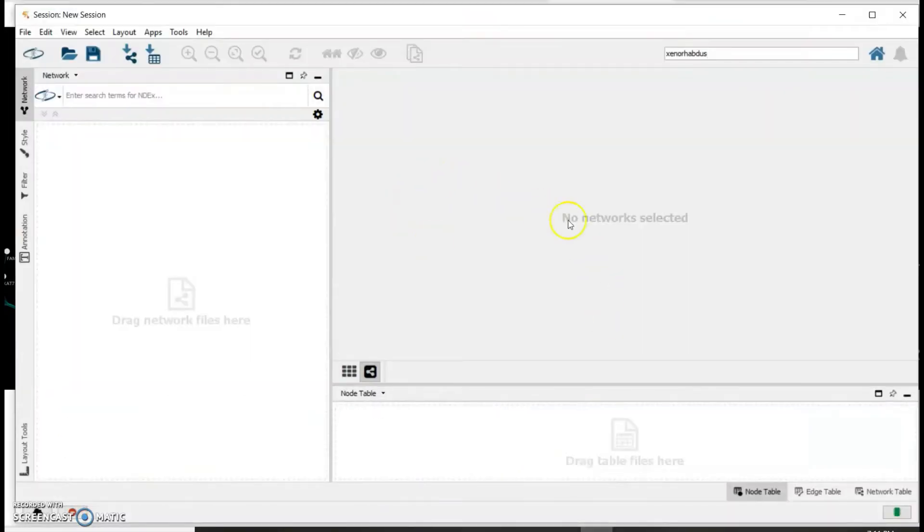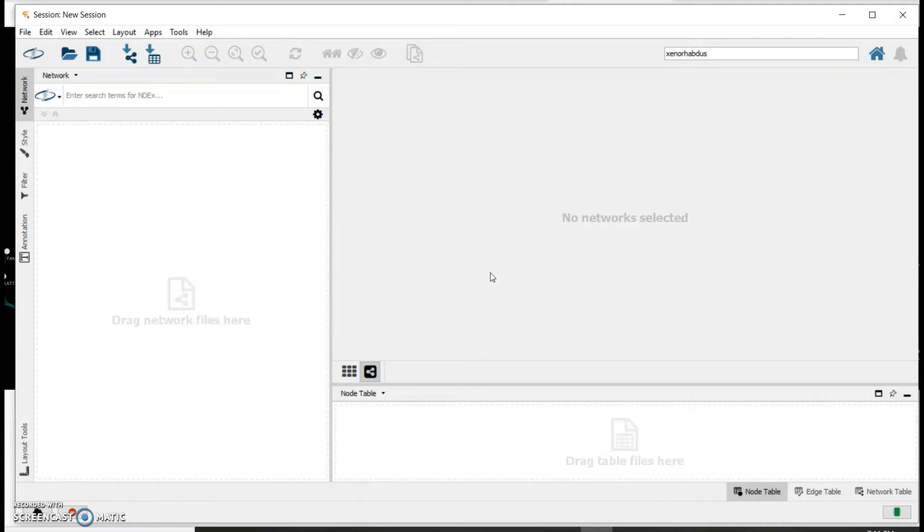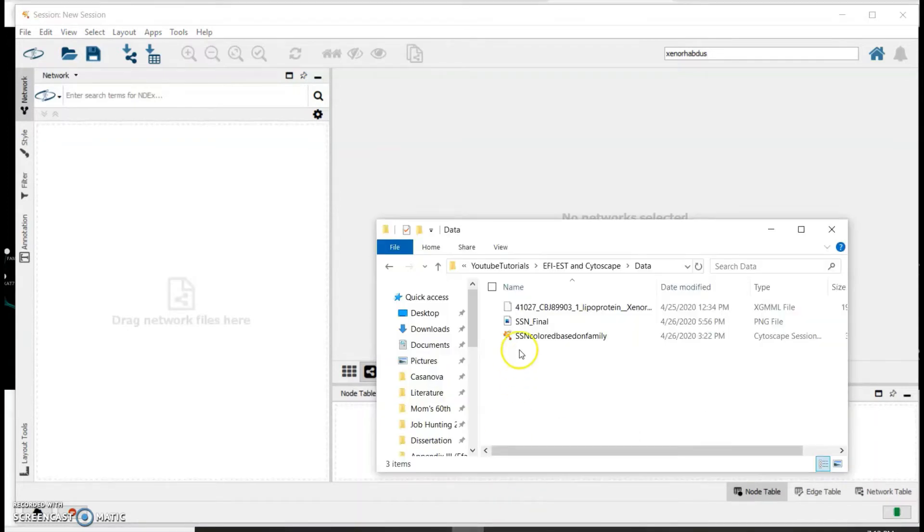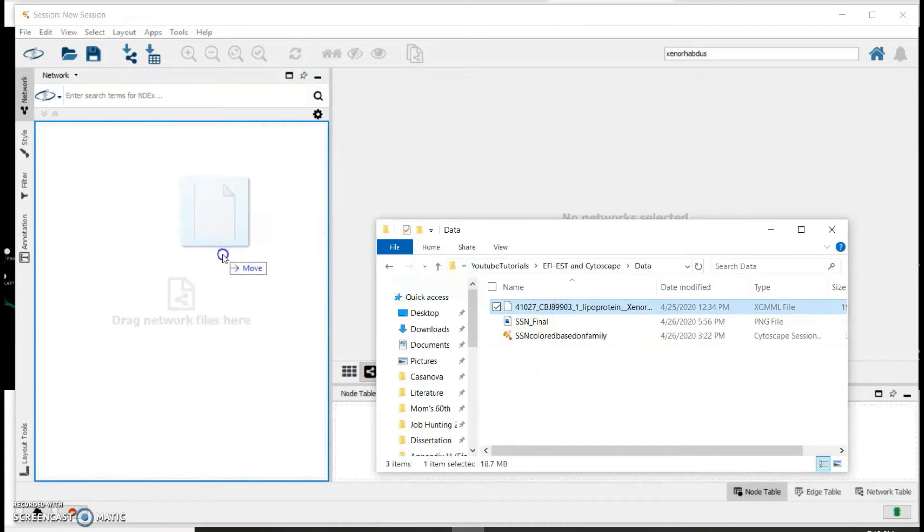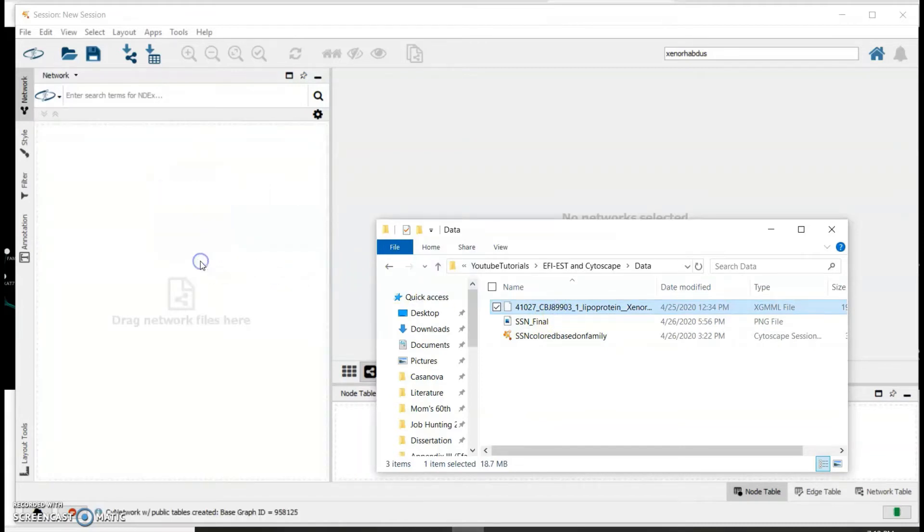It would look something like this. It's a processing intensive program so it takes a while to load and will be faster if you use a computer that has great computational power. To open the sequence similarity network you downloaded, just drag the file - in my case it's this one - into this box right here.